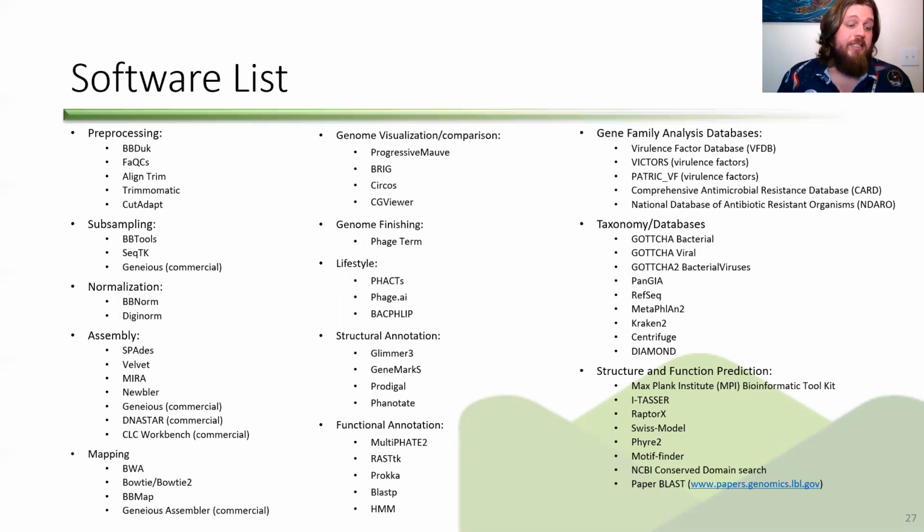Right. Is sequencing required for therapeutic phage use? This is a tough one. I believe it depends on a lot of factors, not the least of which is how available sequencing is to you and your lab. In some places, sequencing is very available. Where we're at, we are very fortunate to have a very good sequencing core right down the hallway from us, and connections at some companies we can use.